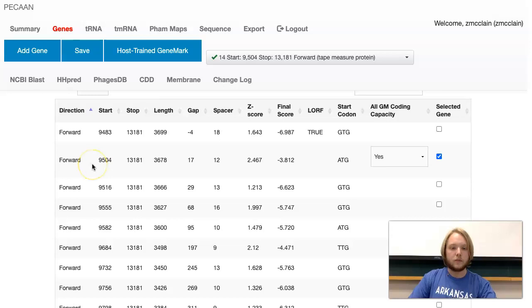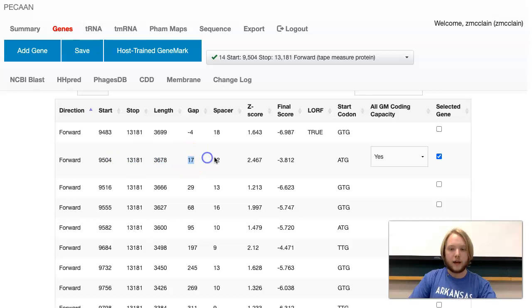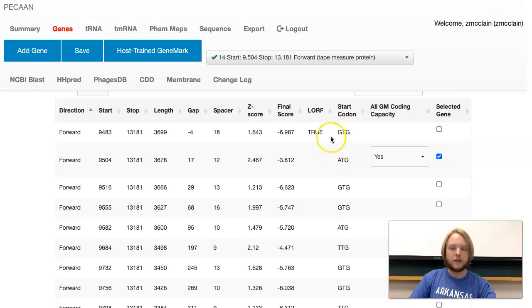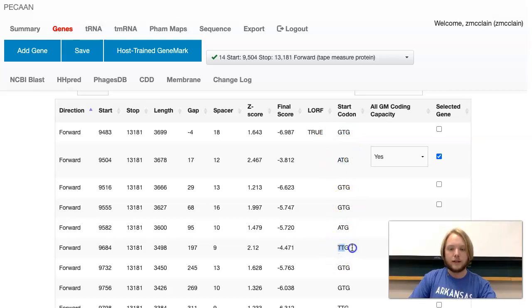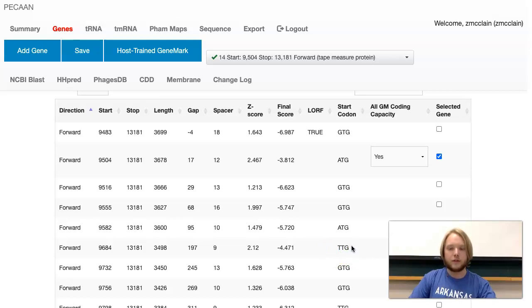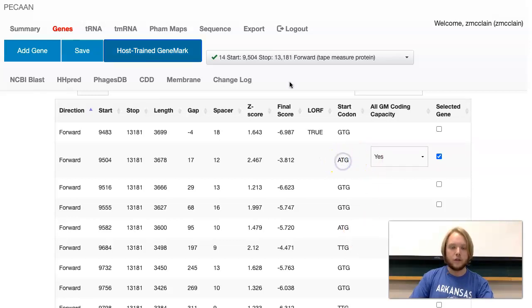I've explained what start codons are, what stop codons are, and what the length and gap are alongside the different types of start codons. GeneMark calls the GTG start codons and the ATG start codons, but it cannot read the TTG start codons. This is something to take into consideration when annotating a gene. However, this will not affect this demonstration because it is an ATG start codon.